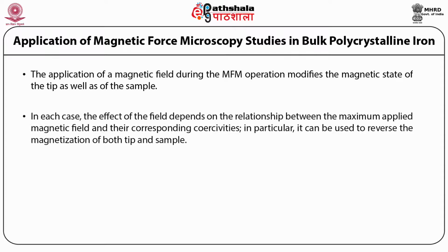In each case, the effect of the field depends on the relationship between the maximum applied magnetic field and their corresponding coercivities. In particular, it can be used to reverse the magnetization of both tip and sample.